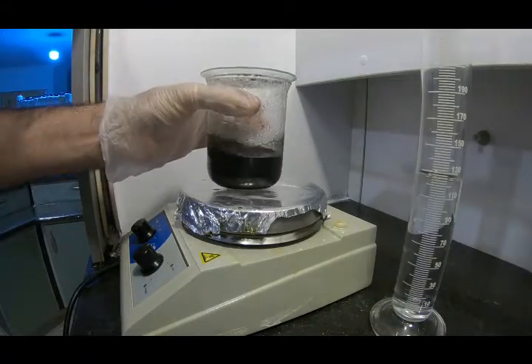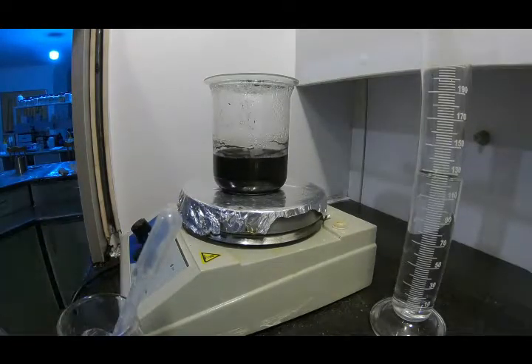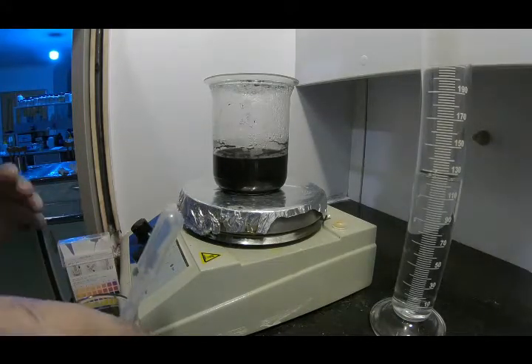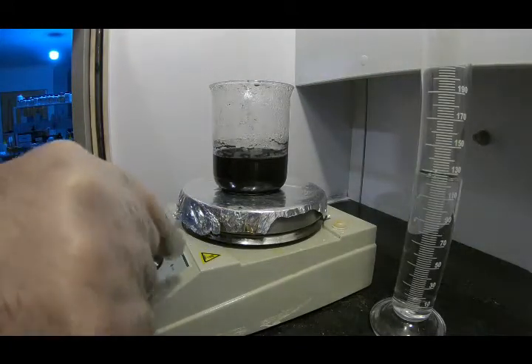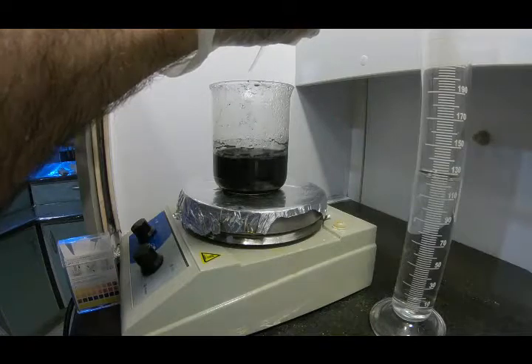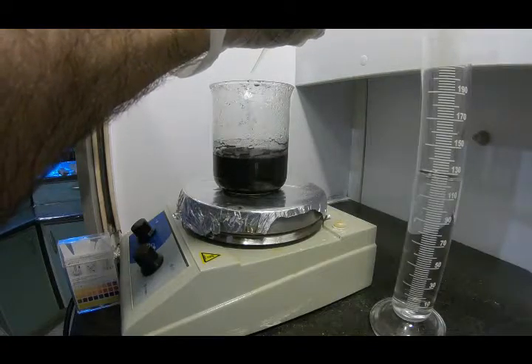After that, you're going to add sodium hydroxide. It just needs to be slightly alkaline, around pH 8 or 9 will be quite sufficient.